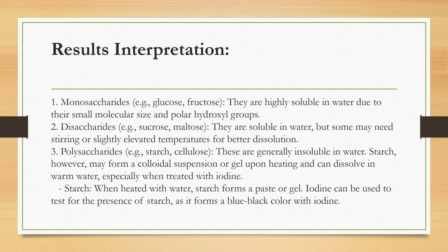Disaccharides like sucrose and maltose are soluble in water, but some may need stirring or slightly elevated temperatures for better dissolution.